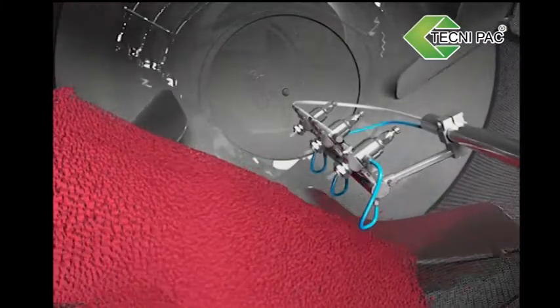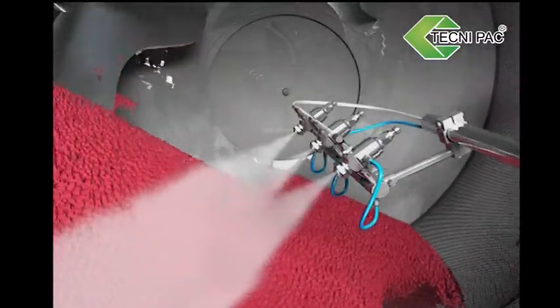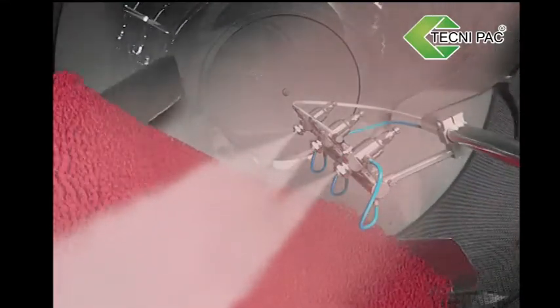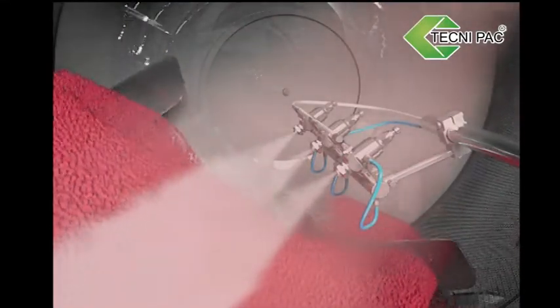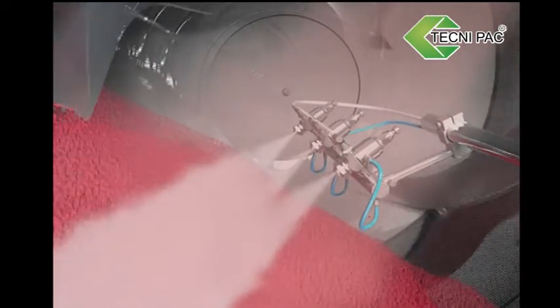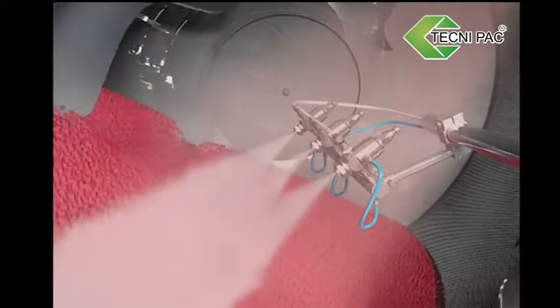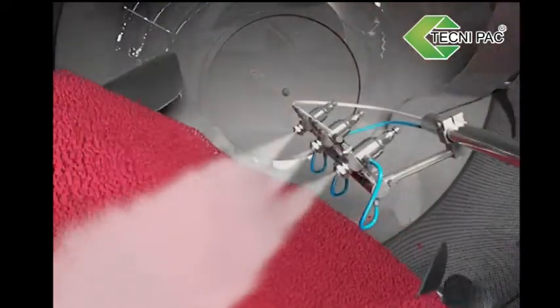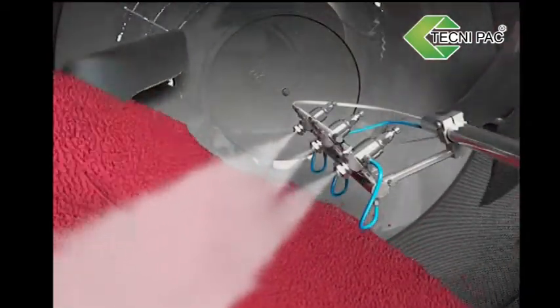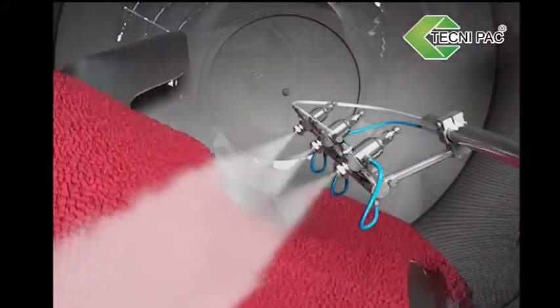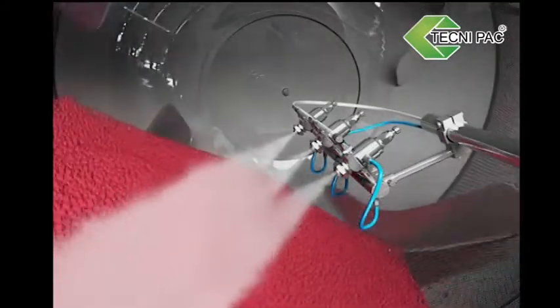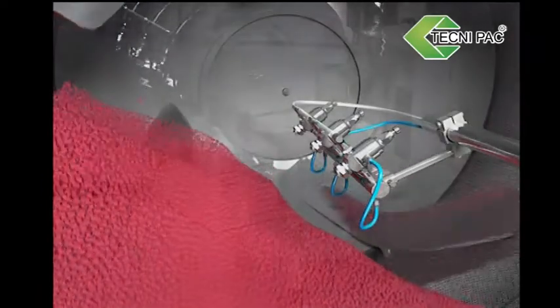The tablet cores make continuous complicated orbital movements within the clean and closed film coating drum. During the process of movement, film coating medium is automatically sprayed according to the process flow and rational technological parameters. Meanwhile, hot air is applied at negative pressure and after passing through the tablet core layer, it exhausts from the bottom of drum so that the film coating medium sprayed on the surface of tablet core gets dried quickly and evenly and forms a firm and smooth surface film.